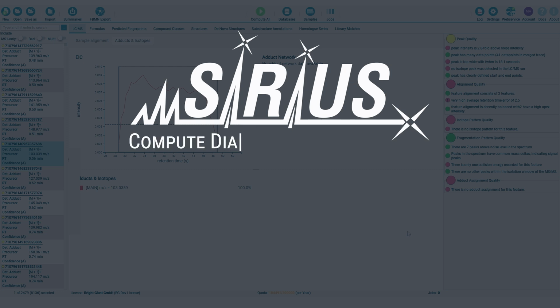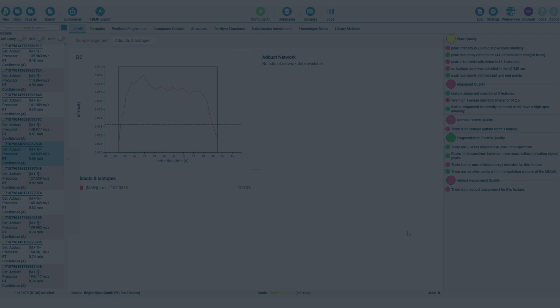In this video, we are going to go over the general structure of the SIRIUS compute dialog. I'm going to focus on only the most important parameters here. Please refer to the more in-depth videos for more details.